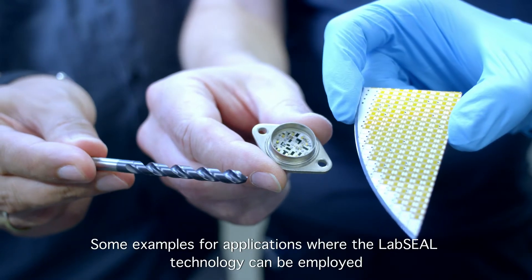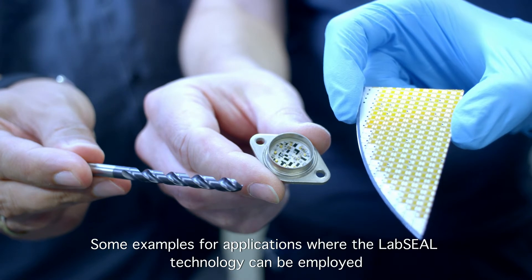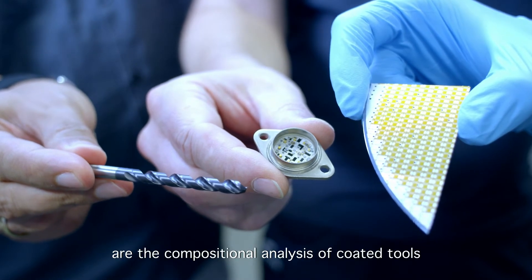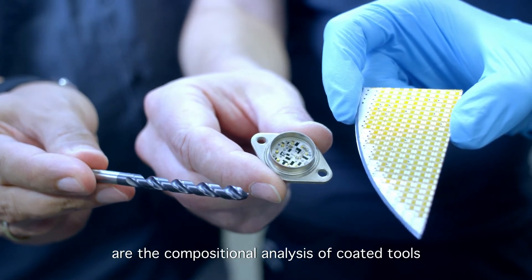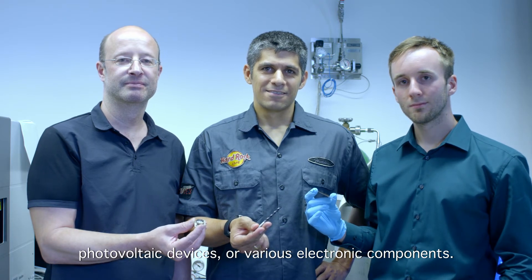Some examples for applications where the LabSeal technology can be employed are the compositional analysis of coated tools, photovoltaic devices, or various electronic components.